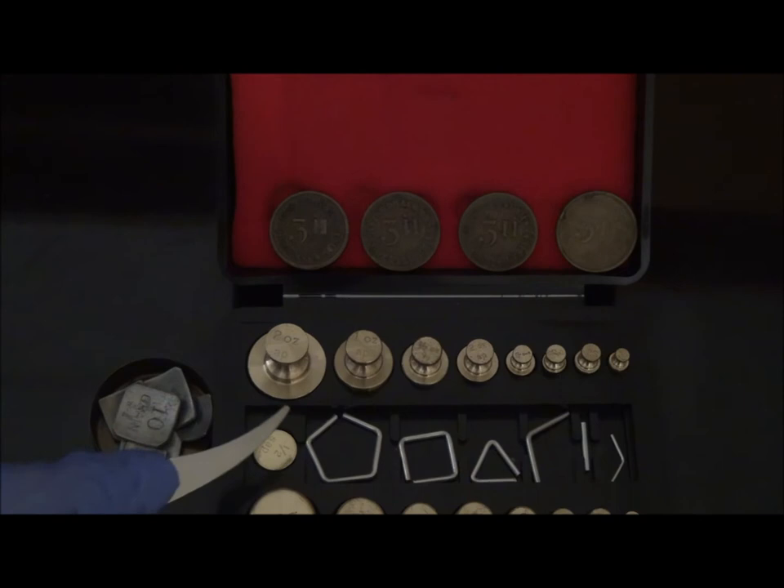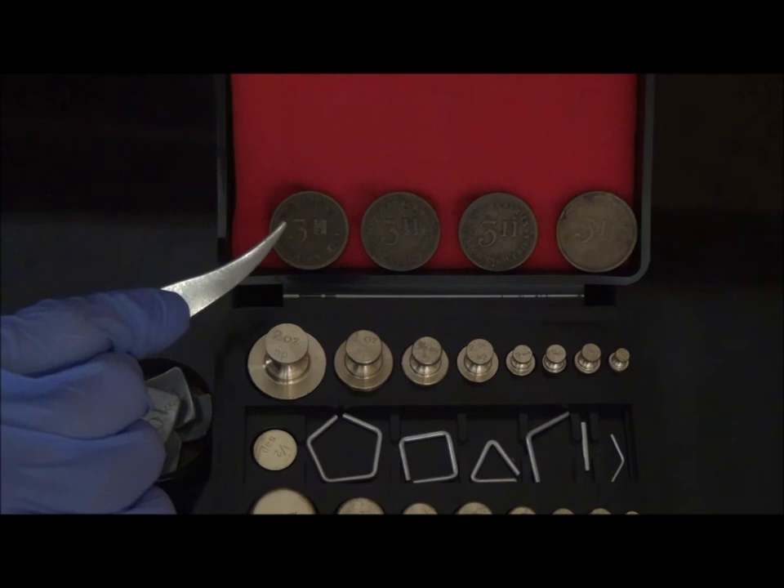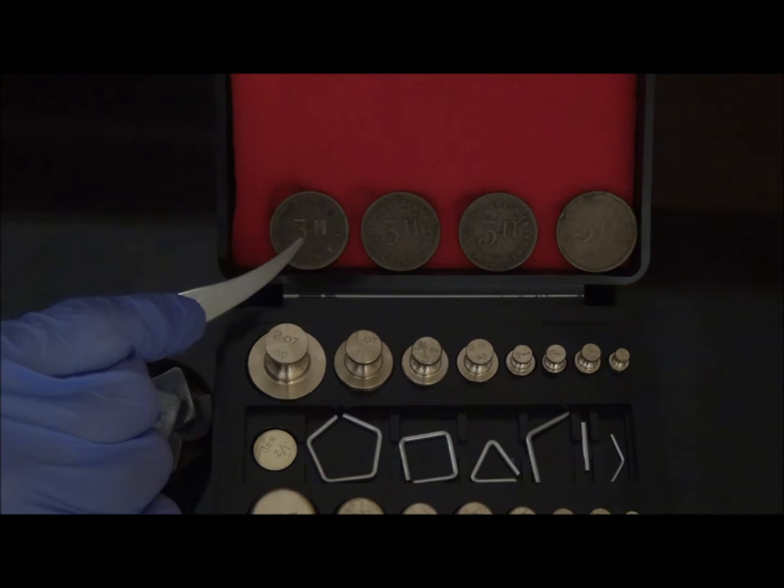Apothecary weights may come as block weights, flat weights, or wire weights. Currently, there is a decreased need for the apothecary system in modern practice; however, in the past, the apothecary system was commonly used for prescribing and dispensing. Apothecary sets with browned flat brass drams still in place in pharmacies should be replaced, since the denominations stamped on their surface are prone to corrosion.